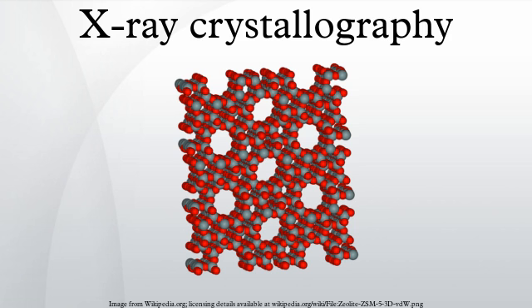It is also common to try several temperatures for encouraging crystallization, or to gradually lower the temperature so that the solution becomes supersaturated. These methods require large amounts of the target molecule, as they use high concentration of the molecule, to be crystallized. Due to the difficulty in obtaining such large quantities of crystallization-grade protein, robots have been developed that are capable of accurately dispensing crystallization trial drops that are in the order of 100 nanoliters in volume. This means that tenfold less protein is used per experiment when compared to crystallization trials set up by hand.